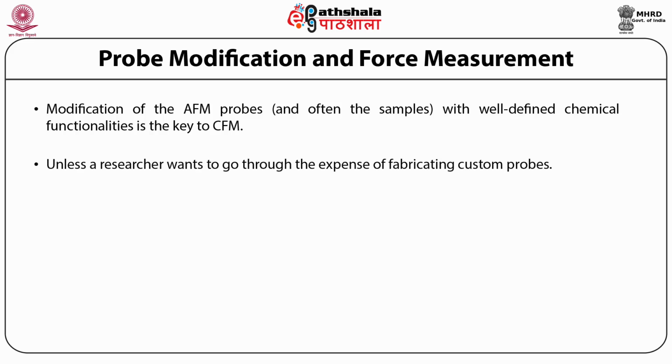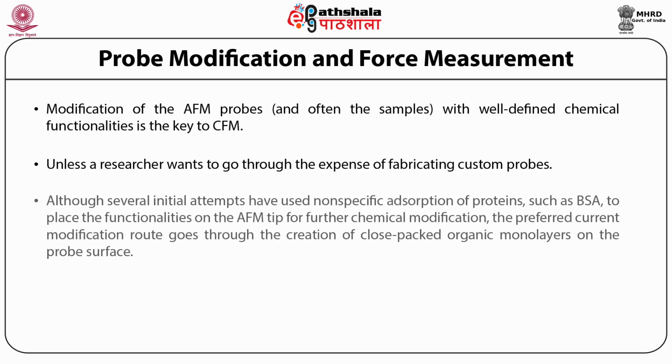Unless a researcher wants to go through the expense of fabricating custom probes, it can be done another way. Although initial attempts used non-specific adsorption of proteins, such as BSA, to place functionalities on the AFM tip for further chemical modification, the preferred current route goes through creation of a close-packed organic monolayer on the probe surface.